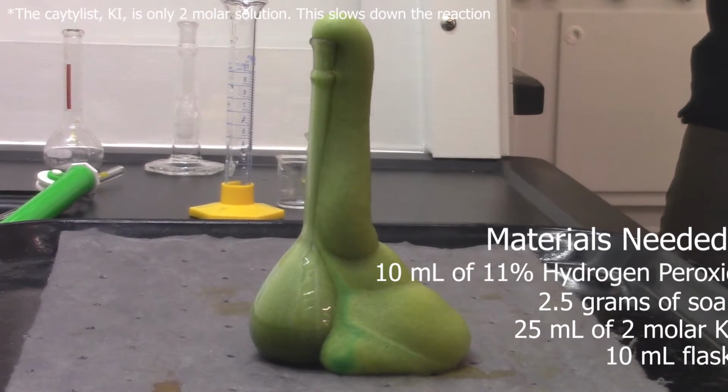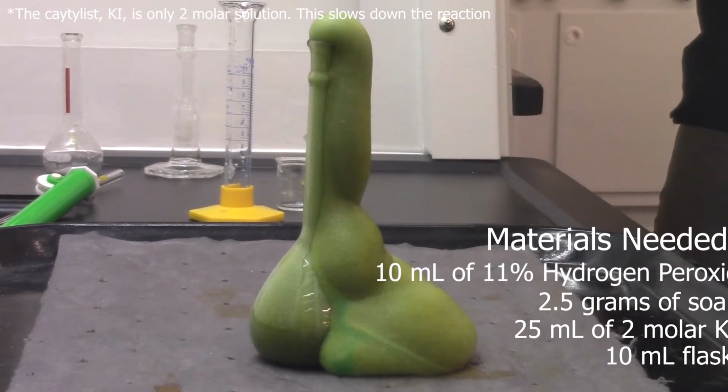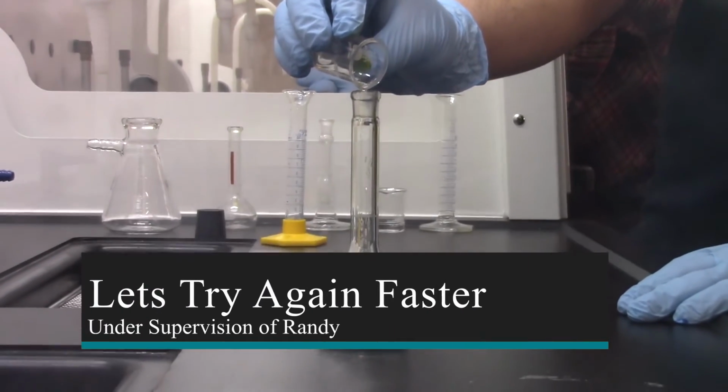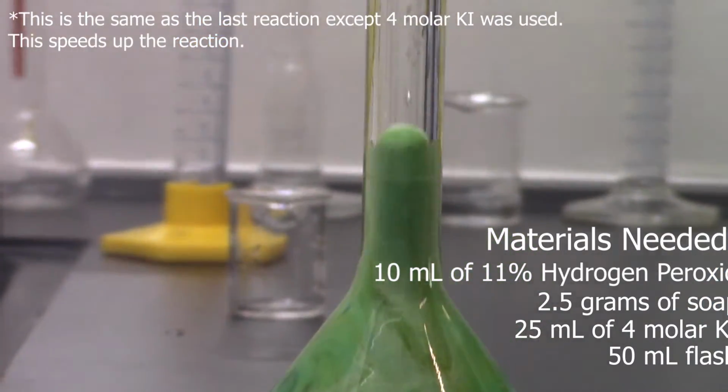It's like lime sorbet. So you're certainly getting a large volume of reaction now. We just need to go quick. If we go too quick, then all of the... Should react faster. Faster, not super duper fast.